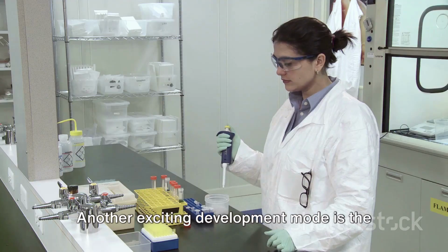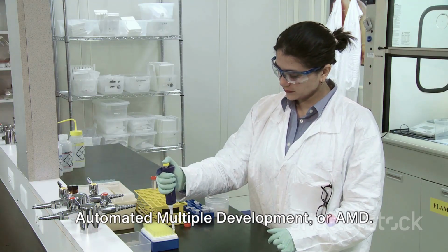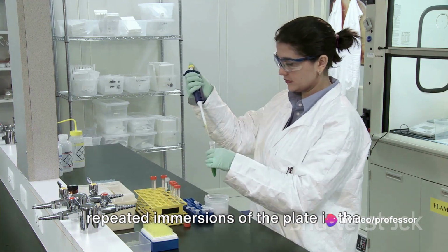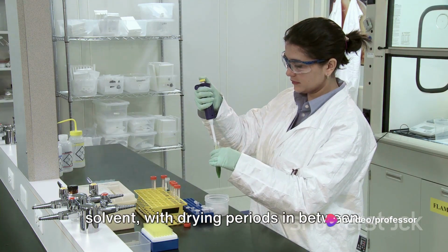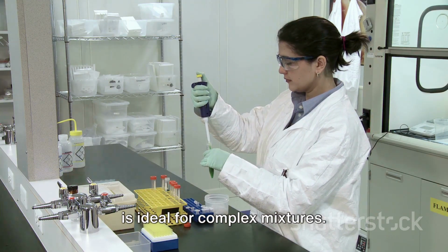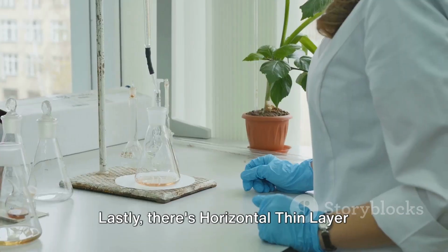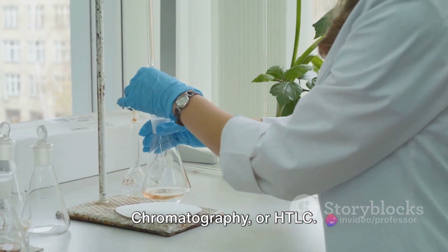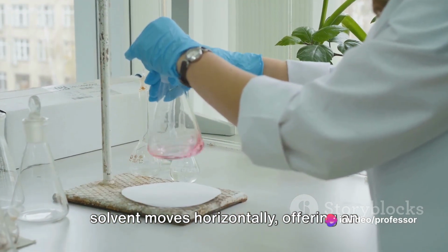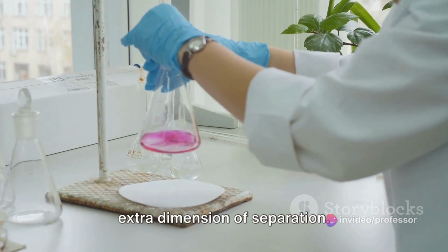Another exciting development mode is the automated multiple development, or AMD. This technique involves automated, repeated immersions of the plate in the solvent with drying periods in between. It offers excellent reproducibility and is ideal for complex mixtures. Lastly, there's horizontal thin-layer chromatography, or HTLC. It's a unique development mode where the solvent moves horizontally, offering an extra dimension of separation.